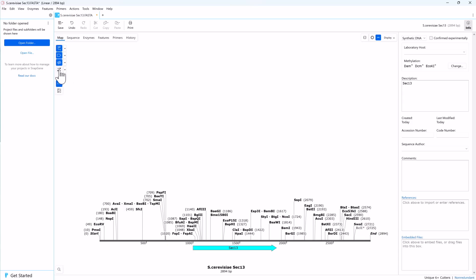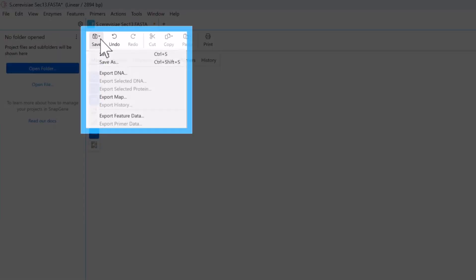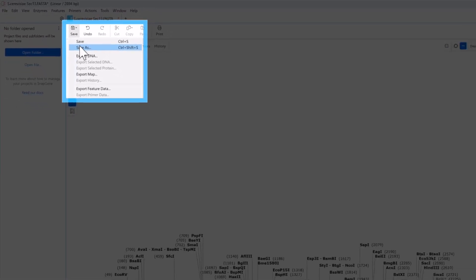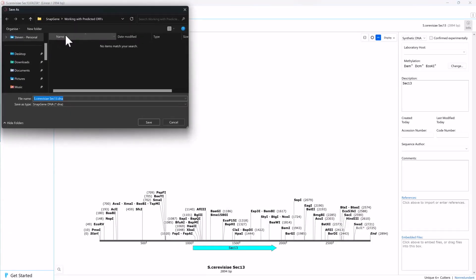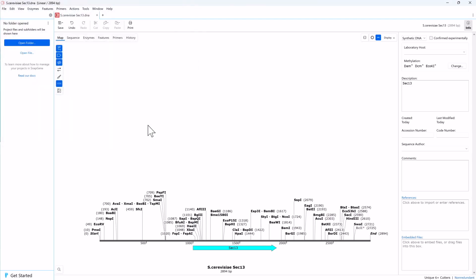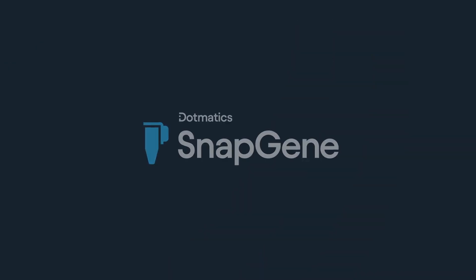Save your file to retain the new feature. And that is how to find open reading frames and convert them to coding sequence features in SnapGene. To learn more, visit snapgene.com.